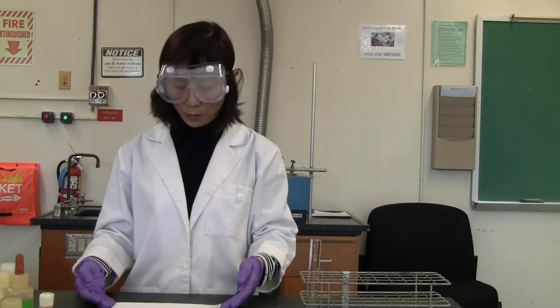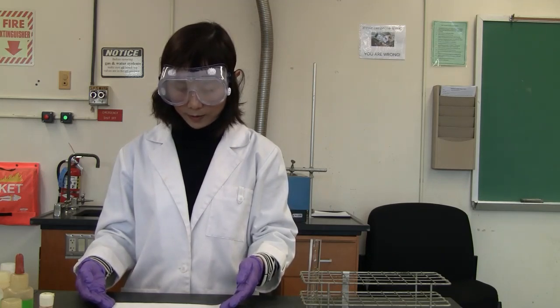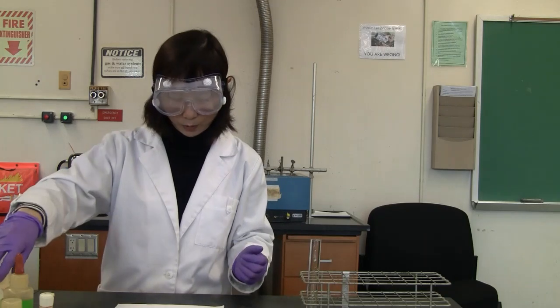Which species, which actually means which ion in the equilibrium reaction, causes the forward shift when you add the sulfuric acid? So think about the sulfuric acid, but write down the ion which makes the change. Step 4, add several drops of the 6 molar sodium hydroxide to the reaction from step 2.